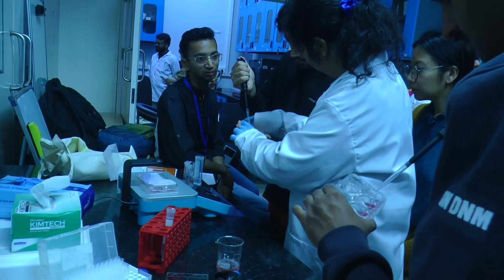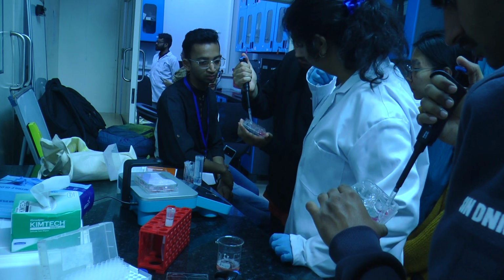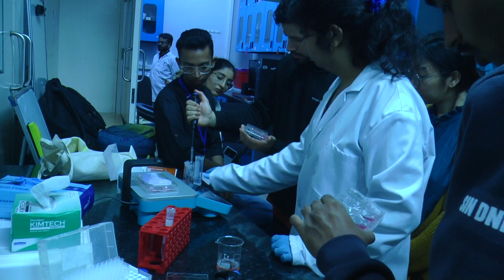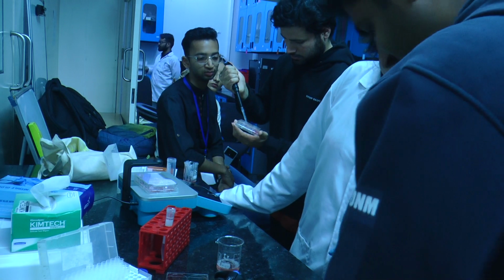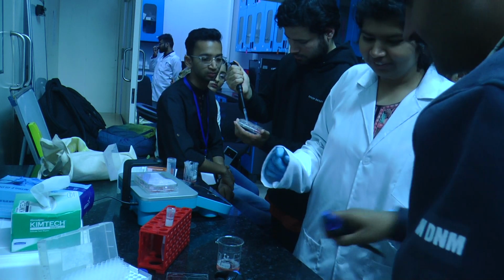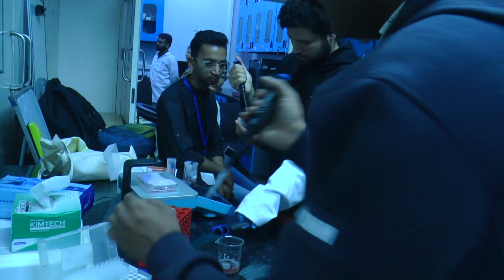The reason we are now using adherent cells is that they stay at one place. If they are moving in solution, it will be difficult because of the number of other components. When they adhere, they spread out, so they attach to the surface.